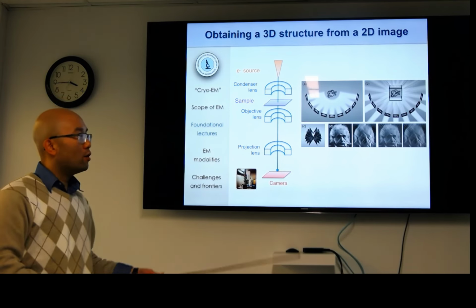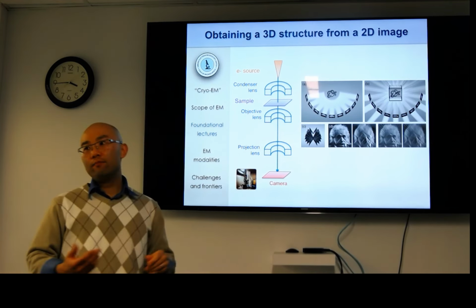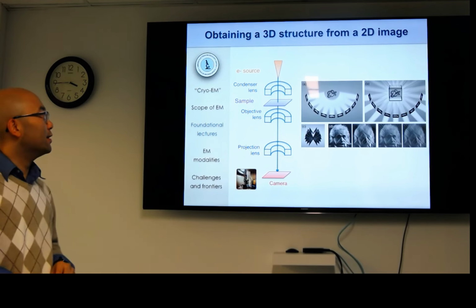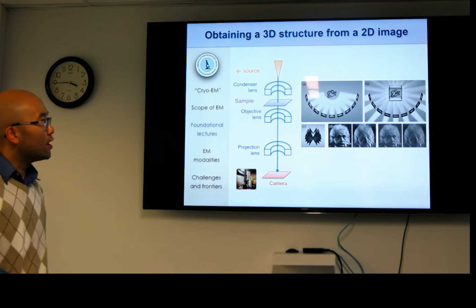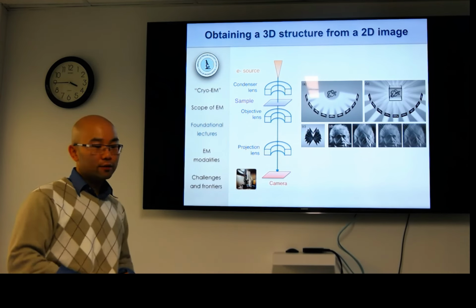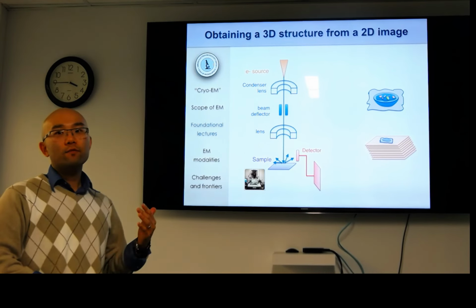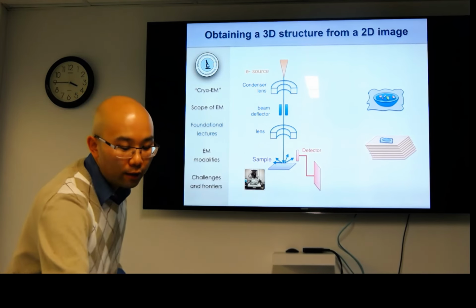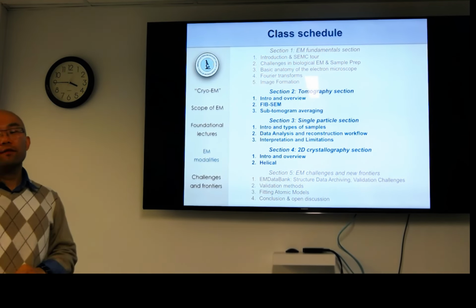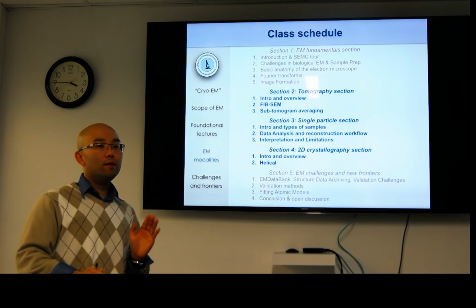Also, something to keep note of is that our instrumentation is somewhat limiting. We can't necessarily sample our samples at infinite degrees and infinite resolution. So there is a compromise on how much effort and time you want to put into data collection versus the end result. And hopefully through some of these lectures you'll get a basis on knowing resolution limitations as well as how to design your experiments. That's the first section. That will be the month of January, and as you see in your class schedule, sometimes we'll be meeting twice a week.